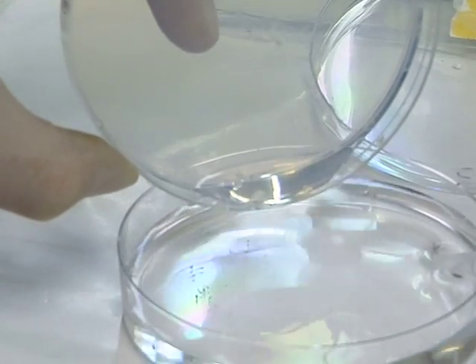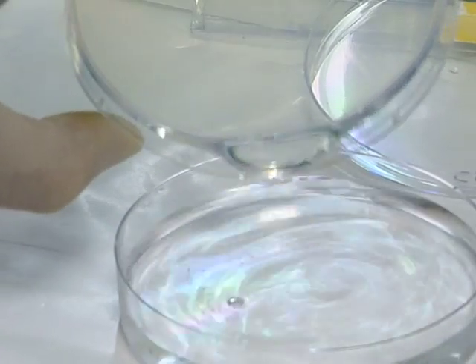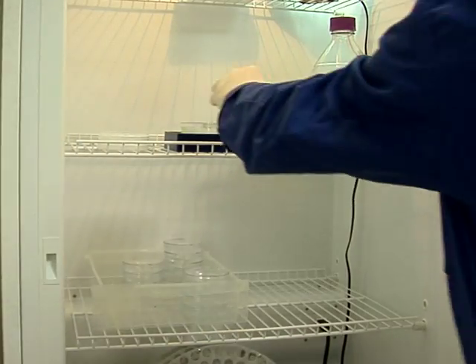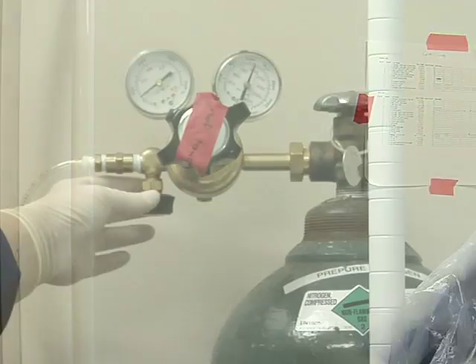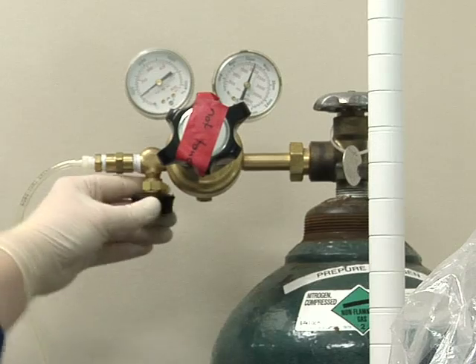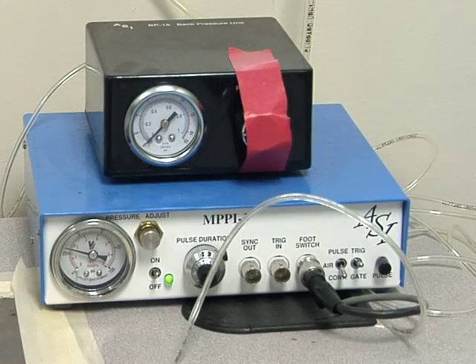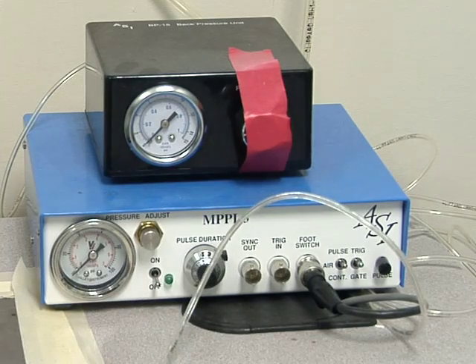Once all the fish have been injected, use egg water to wash them off the agarose and into a fresh petri dish containing 60 millilitres of egg water. Then place the dish at 28 degrees Celsius. Close the nitrogen valve, set the injection switch to continuous to relieve pressure in the tank line. Then, when the pressure falls to zero, set the switch back to pulse and turn off the injection unit.